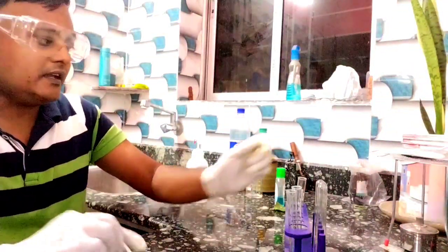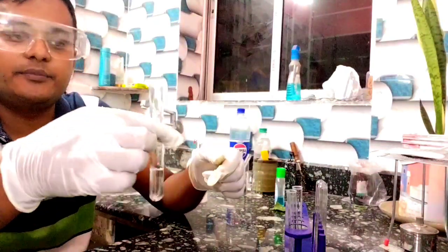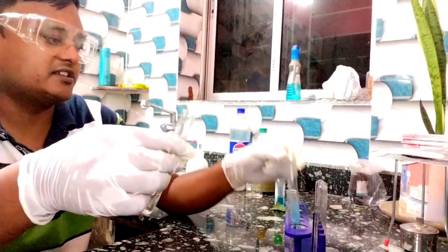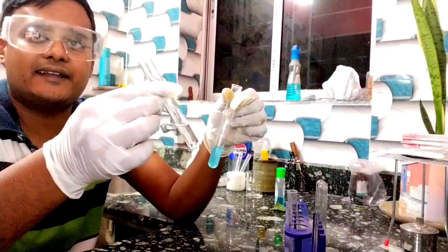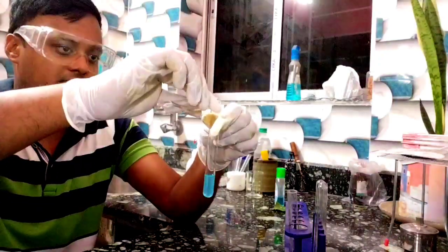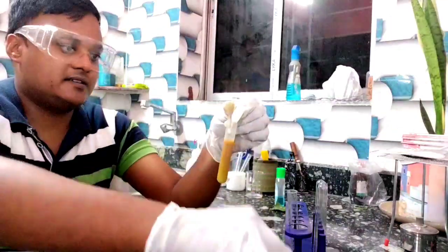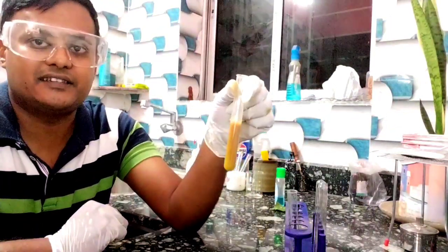See, in the first case I am adding the KI solution. I already prepared that KI solution. It is also colorless. Now you see the change. That is the CuSO4 solution, and we are adding the KI solution. See the change. Initially it will turn brown and hazy.